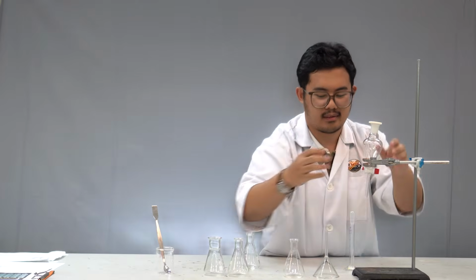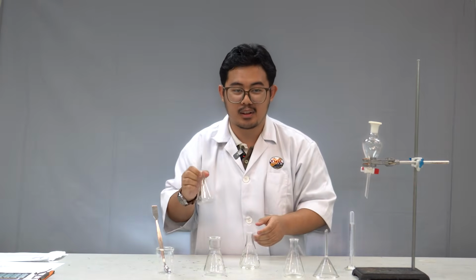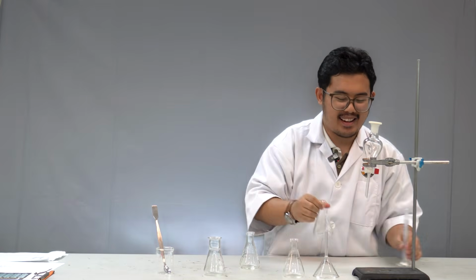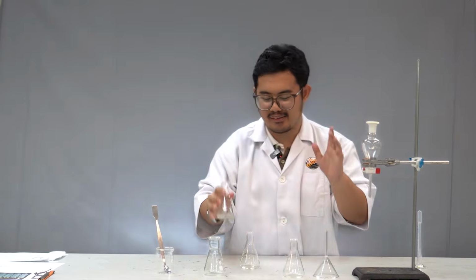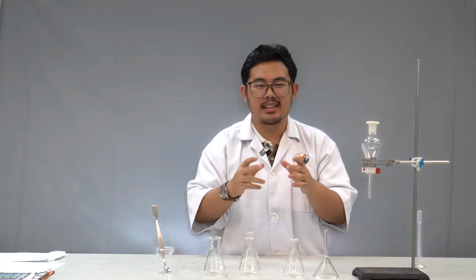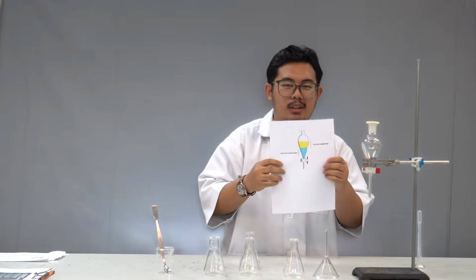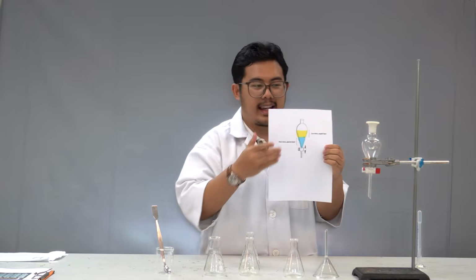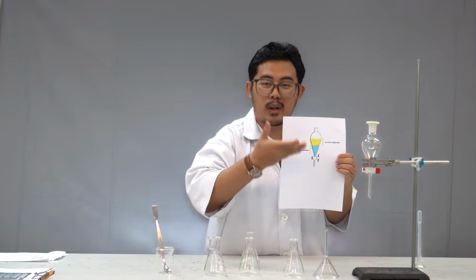Okay. Now, acid extraction. We take the acid conical flask, and we put it under here. Wait. I forgot to mention. My bad. After we mix, there will be 2 layers of liquid. And of these 2 layers, the bottom layer would be the more dense, which is the mixture, and the top layer would be the less dense, which is the acid, which is what we want.